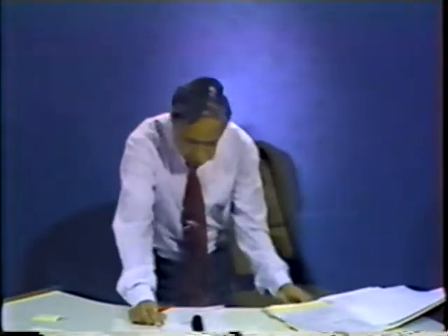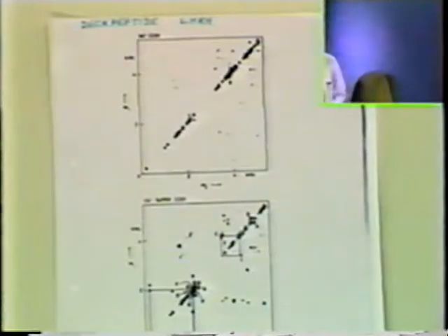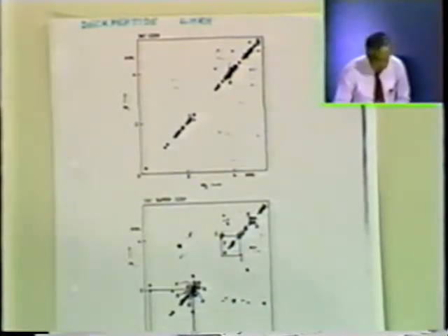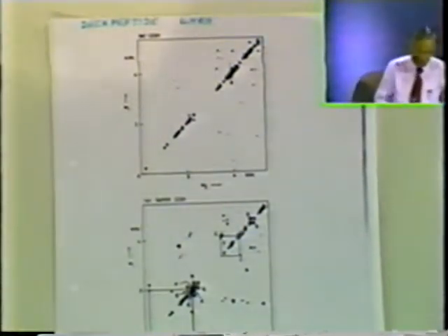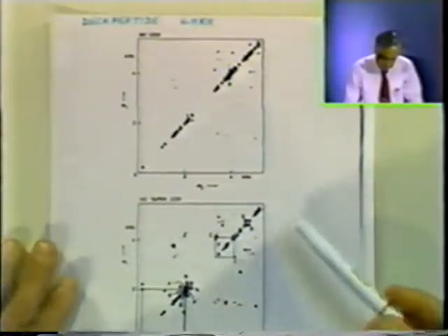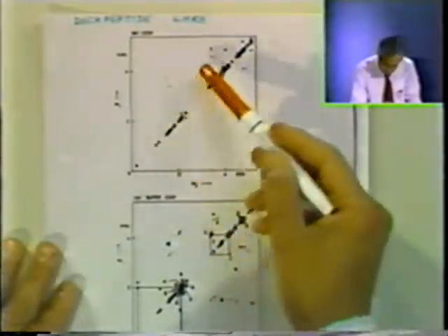And a real example is of a decapeptide, and this picture is with you. Okay, and this is a very quick experiment, a 20-minute COSY with 256 data points for full 10 ppm range, and it was a surprise to me that even in 20 minutes we got fairly good number of cross peaks.